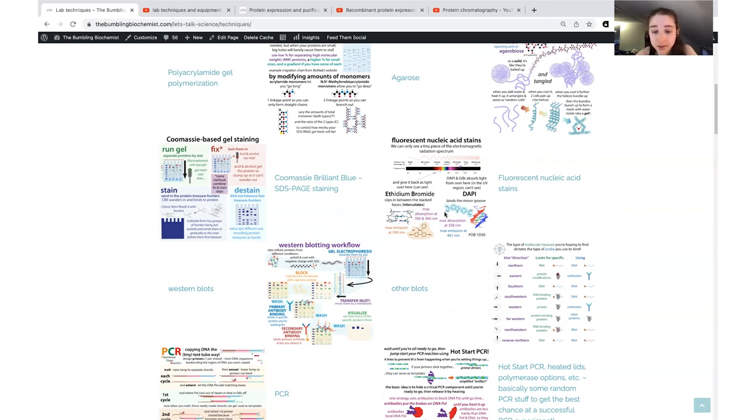There are a lot of other stains as well. Some of these are advertised as being safer, but there's not really that much of a difference between them. And again, this isn't as bad as it seems. But anyway, in either case, you want to wear gloves and do all the typical safety precautions. But in the bulk of things, just be careful and don't eat this sort of thing, but don't be afraid of working with it is my key thing. And more on this in the post on it.